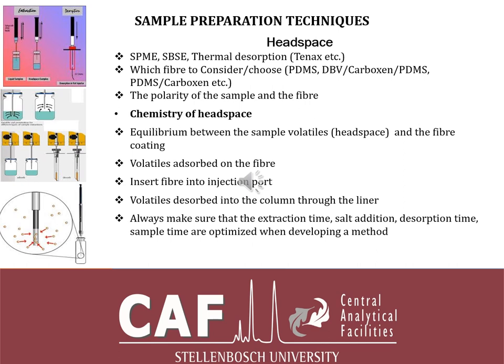And the sample time could also be optimized. Sample time means how much time you take to adsorb your compounds from the sample, and also the sample volume. How much volume do you need for that extraction?